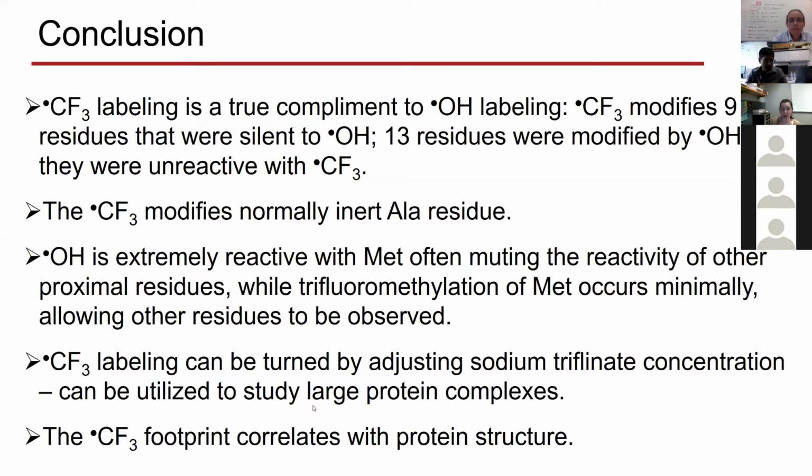And I can tell you right now, we see that the reactivity of tryptophan is the most reactive, histidine next. Then we have phenylalanine, tyrosine labeled, serines. So we're still working to establish this ladder of reactivity, which we're going to publish soon. But overall, this technique seems very complementary and reflects the changes in solvent accessibility.